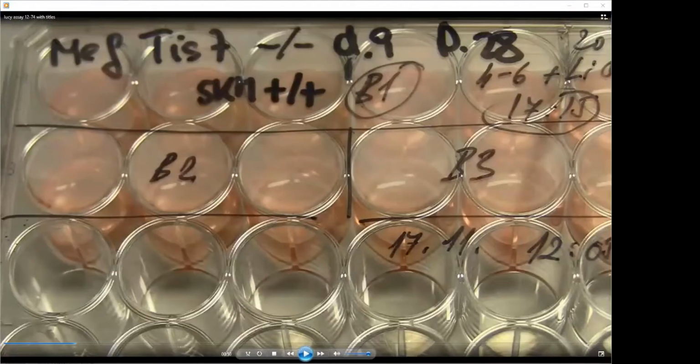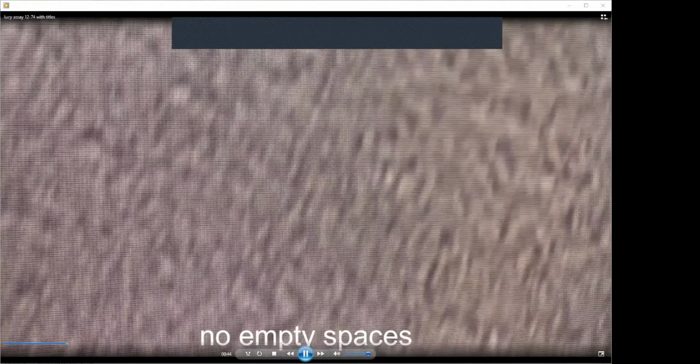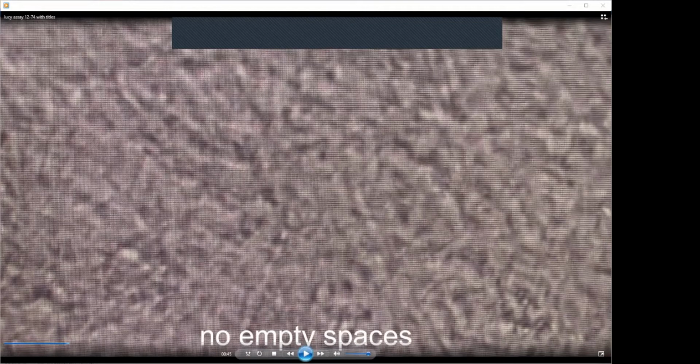On one hand, it is good that cells are not dying, that you have no contamination, and that you have a lot of material to test. But the problem is that also most probably the efficiency of transfection would not be very high, because if you overexpress some foreign proteins in large amounts, then usually cells don't do very well and they are not growing so fast.